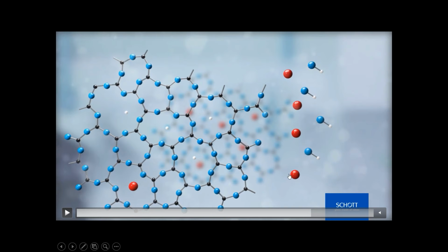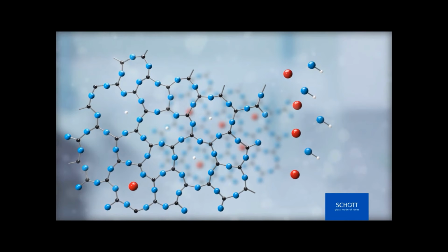First of all, you have the leaching of sodium into the buffer or into the drug formulation, and number two, you have the hydrogen going into the glass. And then when you do that, your hydrogen concentration is going to become lower, and if your hydrogen concentration becomes lower, it's going to become more basic. And if we're changing the pH, then we will see and examine a pH shift.